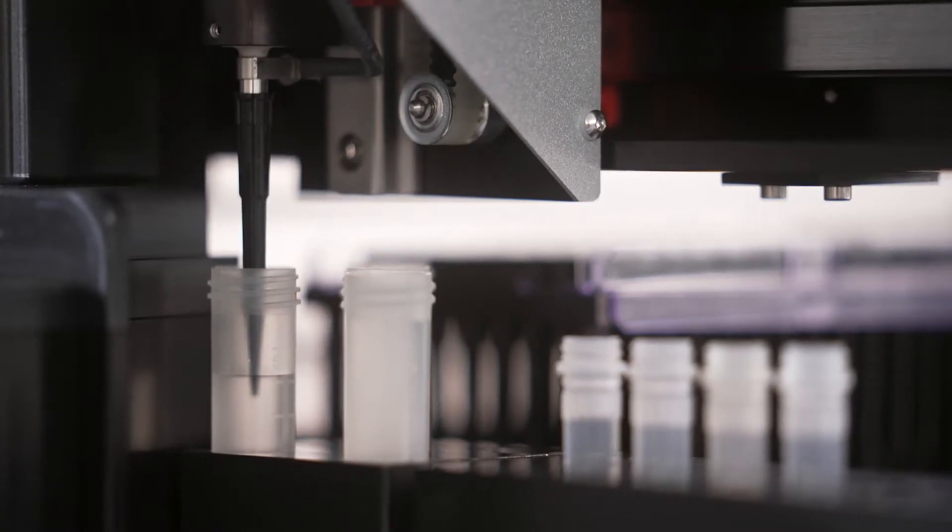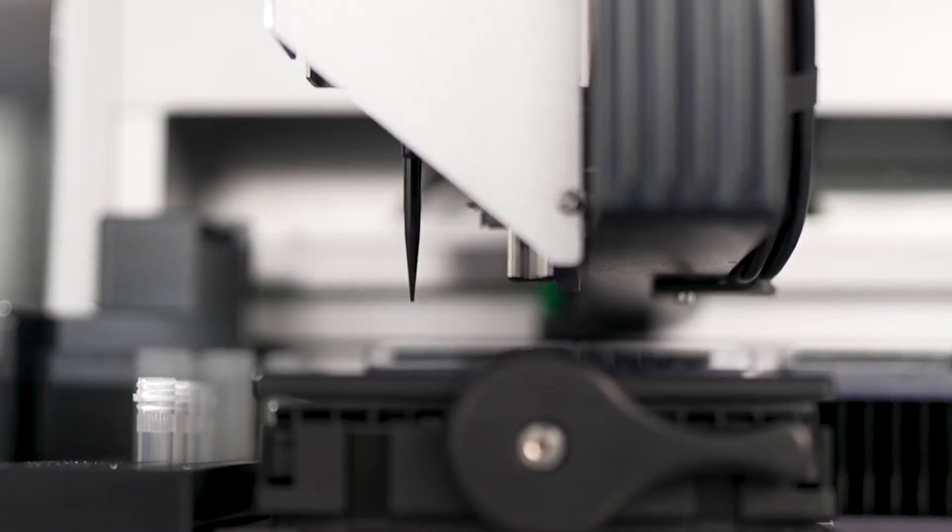With the ChiAgility, you eliminate human error. And on top of that, the ChiAgility maintains pipetting precision and ensures reproducibility. Wow. That's great.